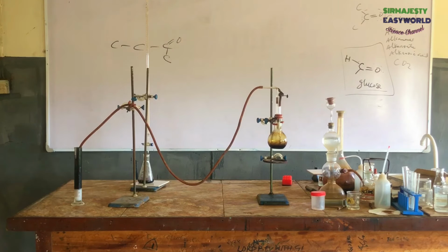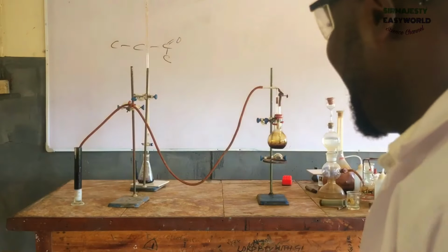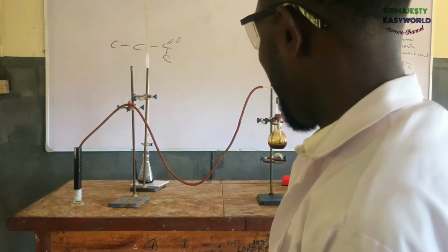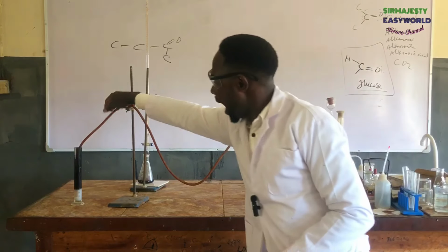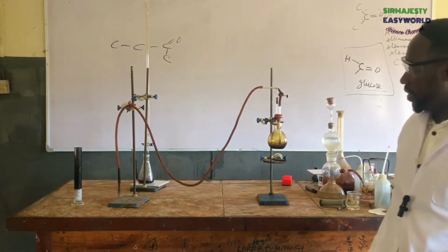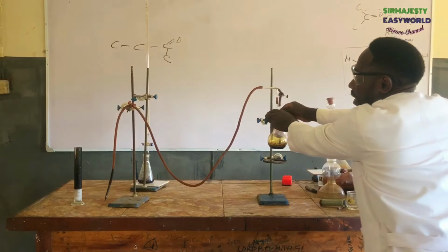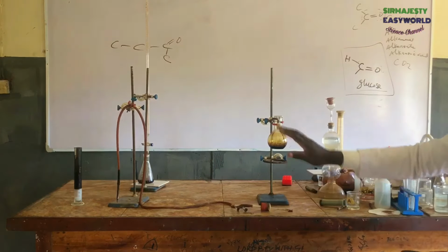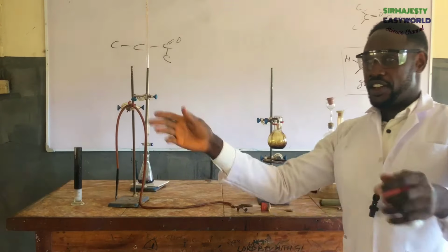Okay. Where is the carbide? Oh my God! You see that? This is funny. When I get close, it will act. Stop this action. Cameraman, I hope you are not shaking. So, final. Damn, get away. But up here, the gas might still mix up. Oh. I know that dangerous thing. Okay, yeah. Done. The distance is far and the concentrations are less. Even when they meet in the air, everything is safe.